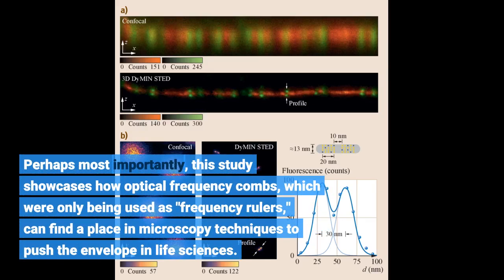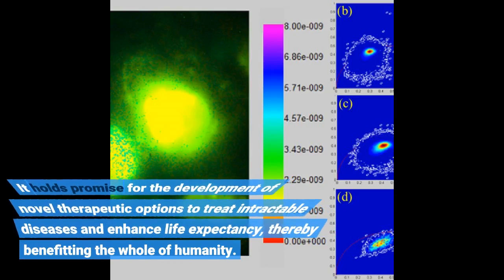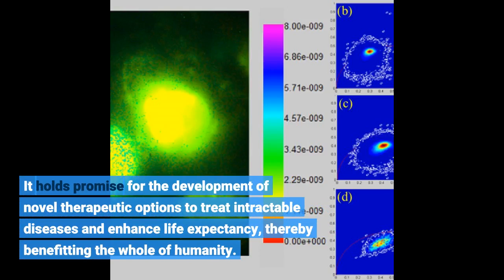Perhaps most importantly, this study showcases how optical frequency combs, which were only being used as frequency rulers, can find a place in microscopy techniques to push the envelope in life sciences. It holds promise for the development of novel therapeutic options to treat intractable diseases and enhance life expectancy, thereby benefiting the whole of humanity.